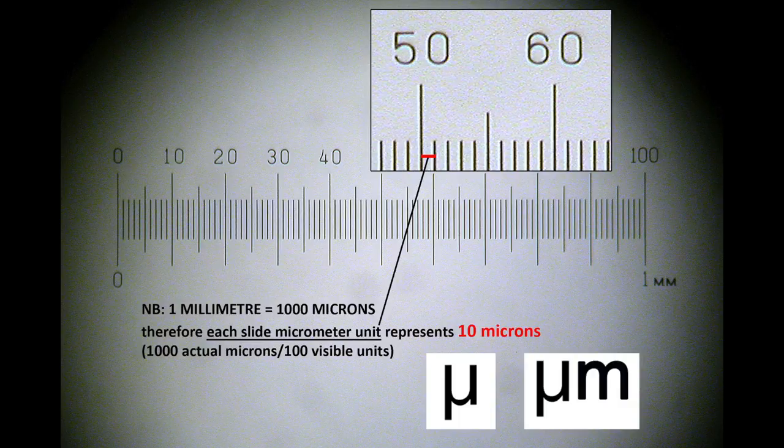If the eyepiece graticule is positioned correctly, and you have successfully set up the slide scale micrometer, then if you look down the eyepieces, you should see both scales.